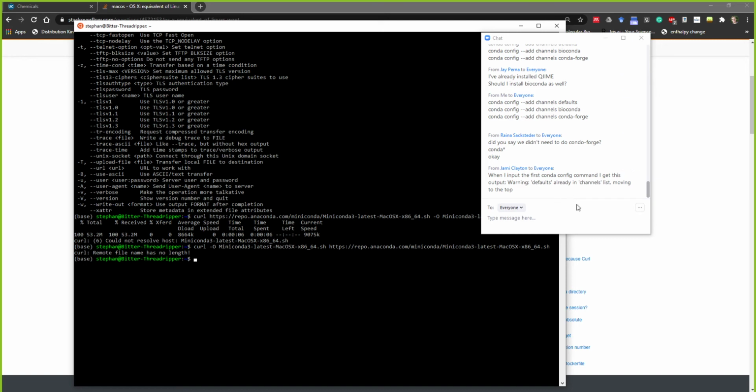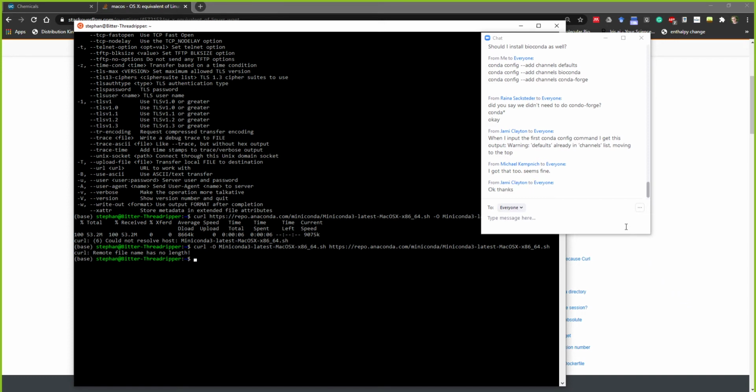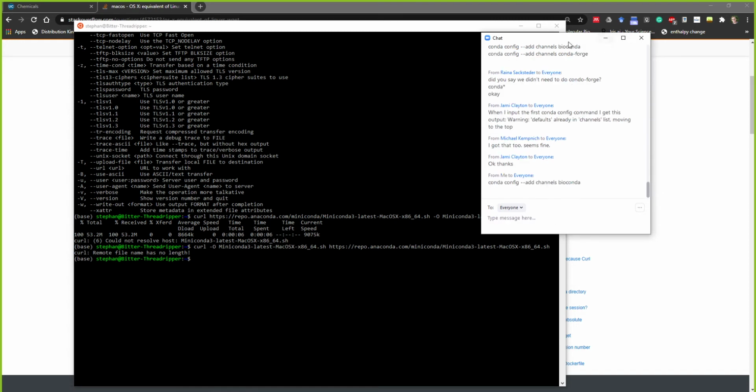And that warning sounds fine. I got a warning, defaults already in channels list, moving to top. That's okay. That's good. And then you could actually stop at BioConda if you don't want to do conda-forge, but I don't mind. Yeah, might as well.